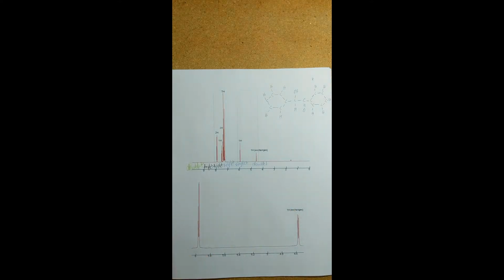Okay, now that that's been completed, we are going to move on. Due to the sheer size of this structure, I just went ahead and circled all of our hydrogens or protons, and I labeled them respectively to their deshielding, and I'm going to go ahead and explain that now for you.